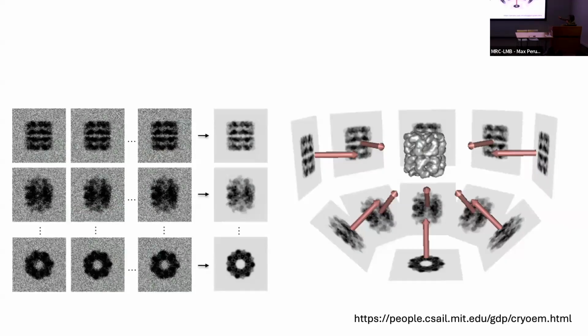Then projection back. This is the model, but if you have a model of different projections, you can see here. So this is the original image. You build this one into this one, and then calculate back, and repeat to get a model more like the real image.